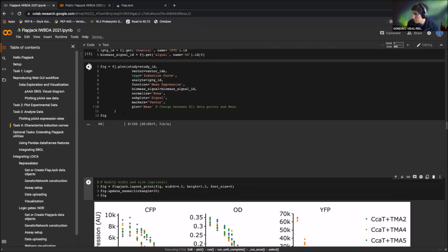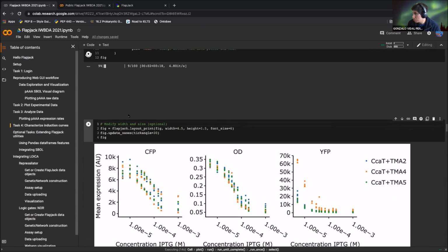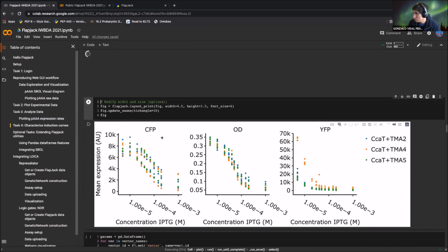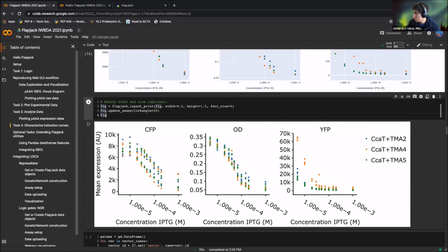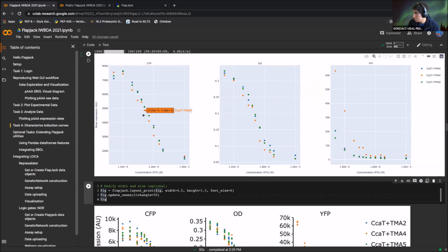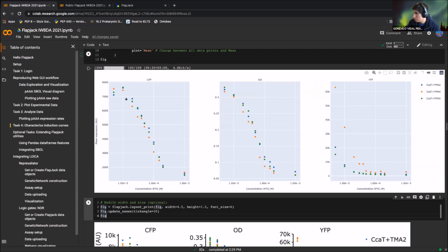And as well as the first plot, I can show you the layout, the choose layout for print. This is the one, so hopefully it's useful for the people. I think almost everyone wants customized prints here, but this is a pretty good final result. And here we can see better the curve without all the replicates, just the mean.